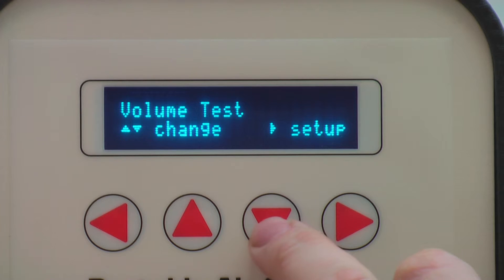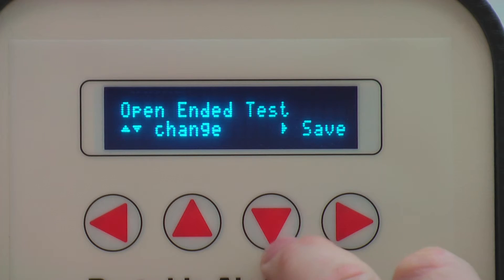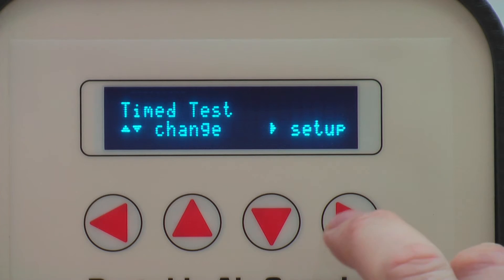The up and down keys will allow you to access the type of test selected. You have the following options: open ended test, time test, volume test, delayed time test, and delayed volume test. If you choose the open ended test, pressing the right arrow will just save this as the default mode.